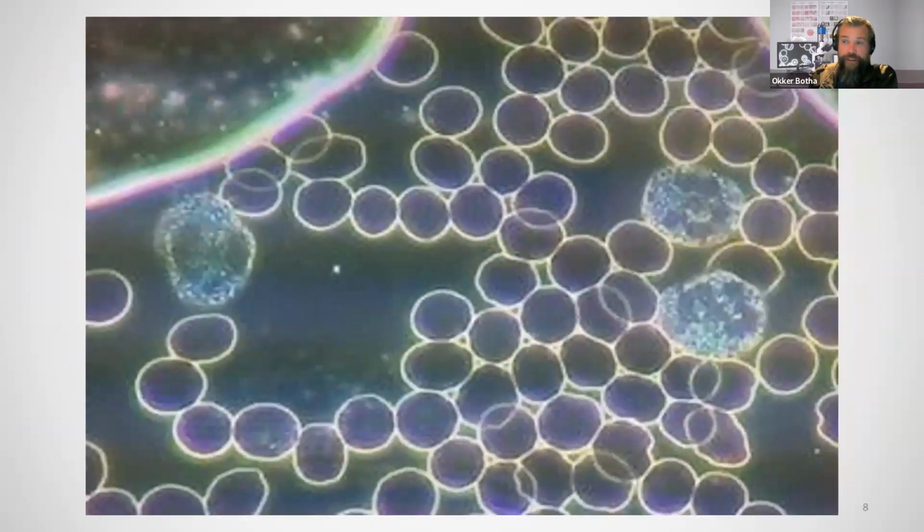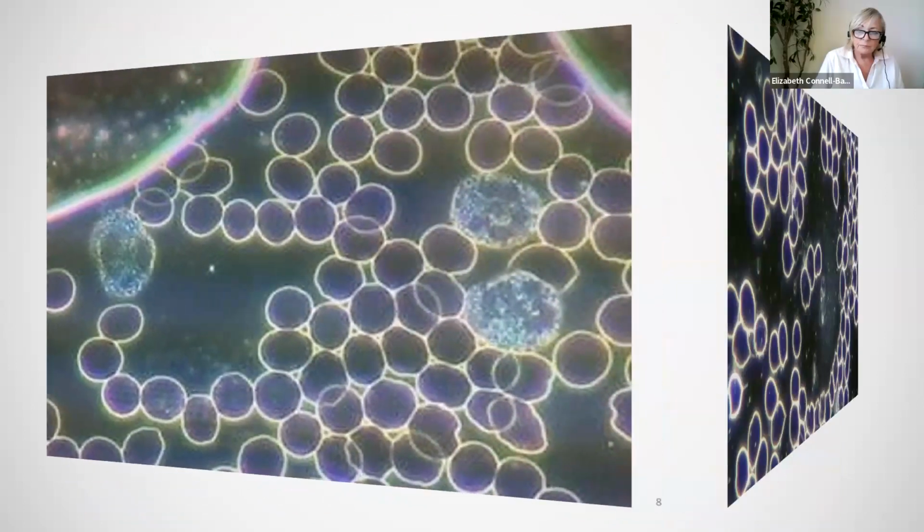Right. Again, also an inferior microscope system. You may wonder why the image looks grainy. It's also because of the type of camera being used. This looks to me like an older type of analog camera, the older type of cameras that they used to use with microscopes. But again, looking at what we can see, or in this case, can't see between the cells, there's really not much visible there at all. Not much detail.